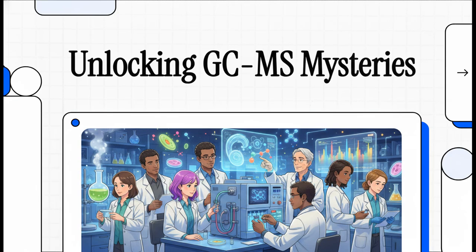I'm your host, Dr. Chem, and today we're going to dive into the absolute gold standard of chemical analysis. We're going to see exactly how scientists decode the invisible world all around us using an incredibly powerful technique called gas chromatography mass spectroscopy. And I promise you, by the end of this, the microscopic world is going to make a whole lot more sense.